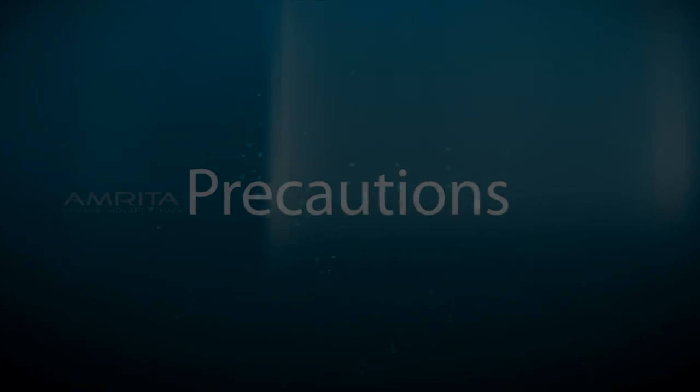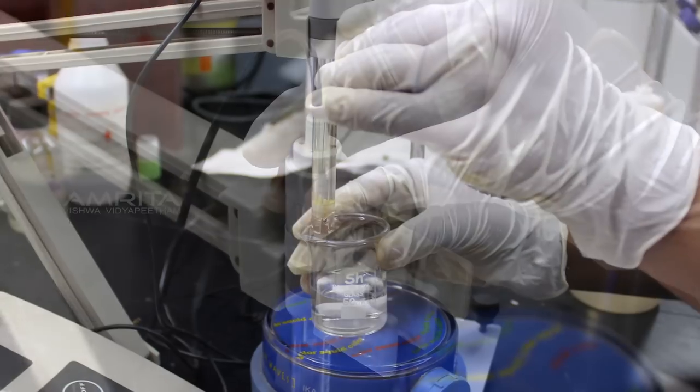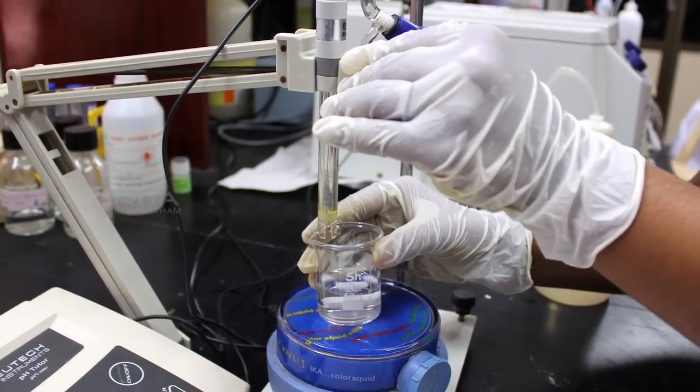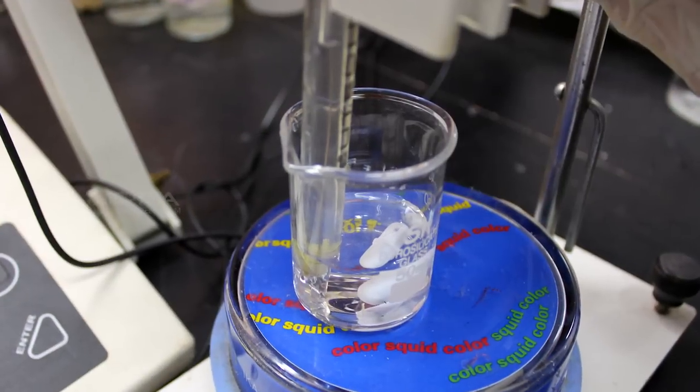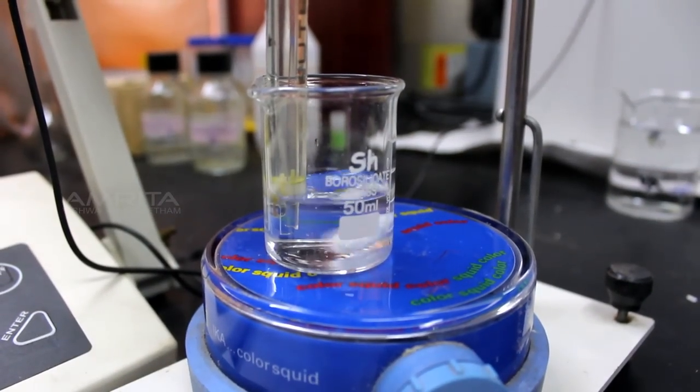Precautions: Always clamp the electrode in order to avoid the bumping of stir bar with it during stirring. Make sure that the electrode is properly immersed in the beaker containing amino acid solution otherwise the pH reading will be erratic.